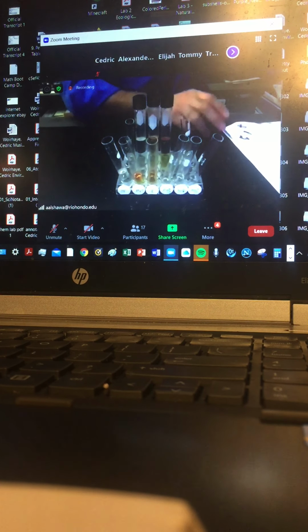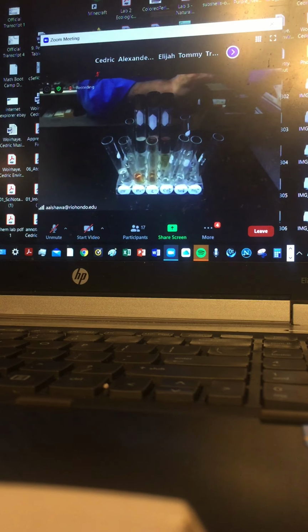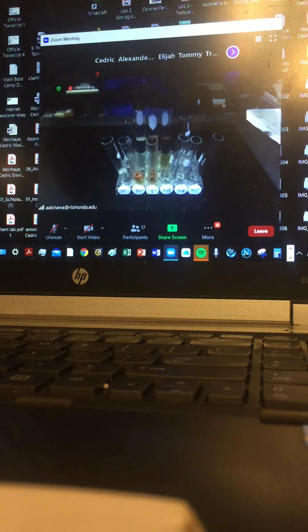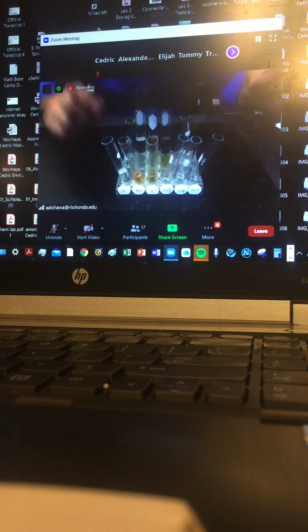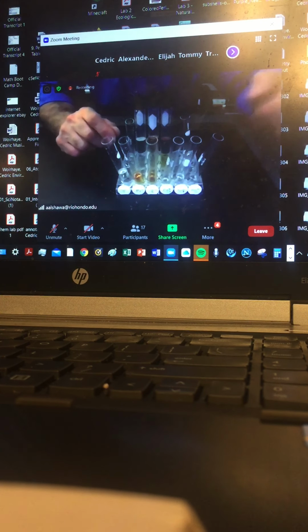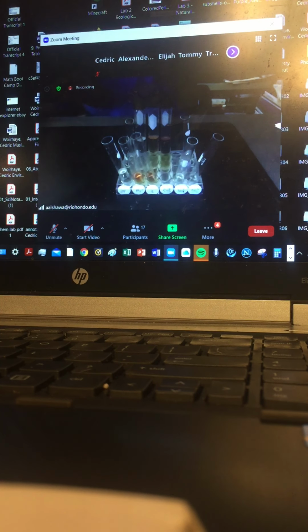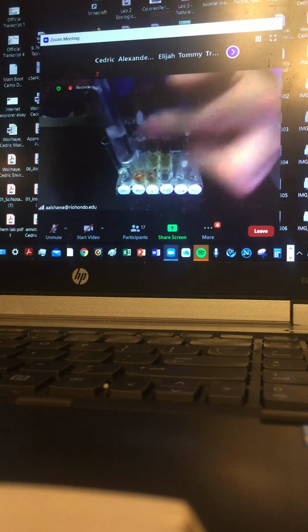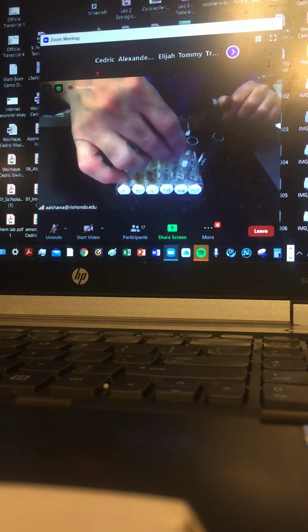So I'll do the same. So I'll be adding, oops. Okay, so this is also the expected background. Yes, I tainted my, so I've done some chemistry. All right. So in here, I want to add the same. So I want to add the hexane layer, see the outcome, and mix them. I guess because of that tab that I've added, there's nothing. So the outcome is basically clear, except the obvious two layers, top organic and the bottom aqueous.